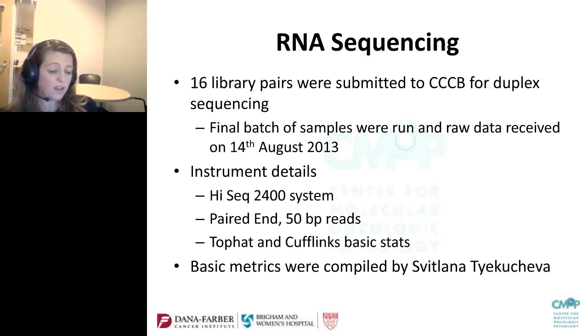As for the instrument details, we used a HiSeq 2400 system. We selected paired end 50 base pair reads, and then we used basic computational programs like TopHat and Cufflinks to generate some basic stats.